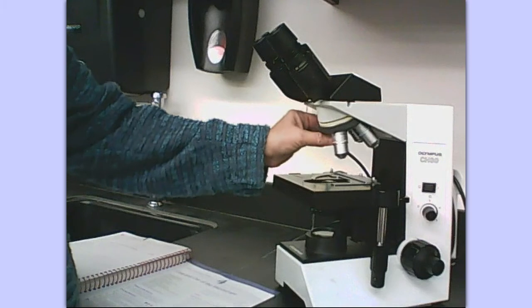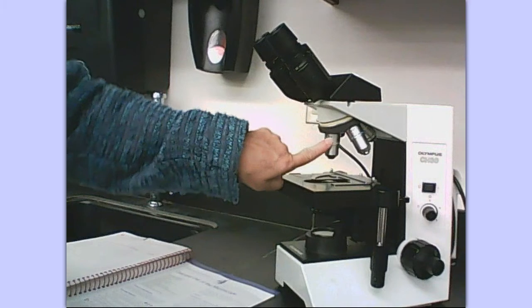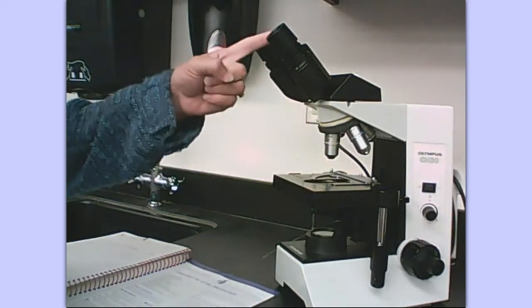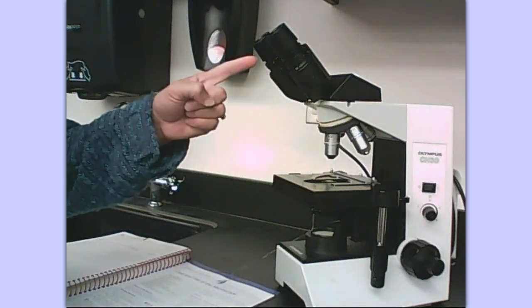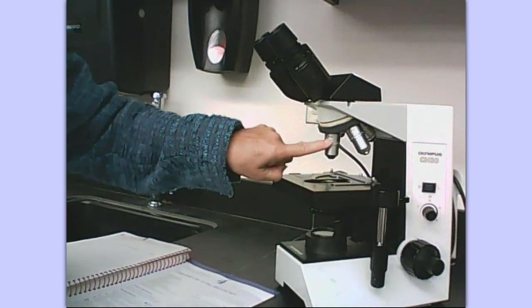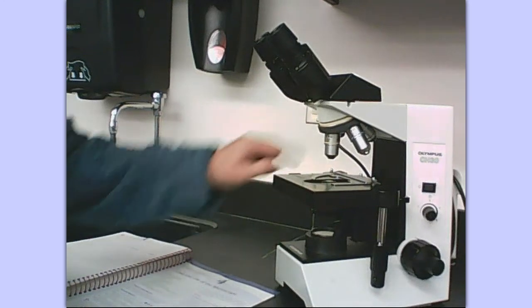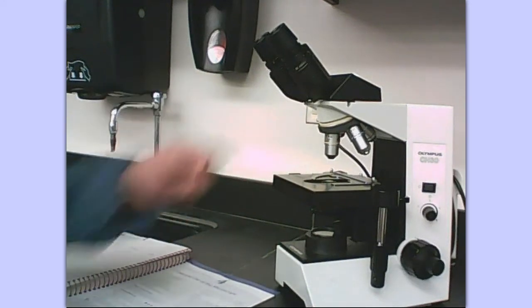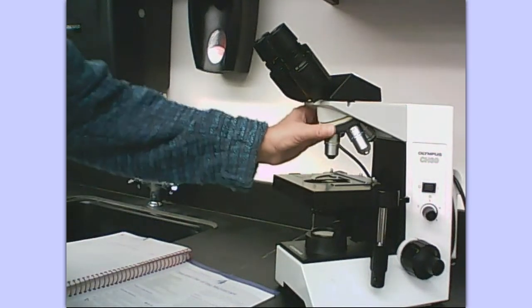The next objective is low power, and it has a magnification of ten. We're using two sets of lenses to magnify: the eyepiece is ten and the objective is ten, so the total magnification is ten times ten — one hundred times. So if we're using this objective to focus in on an object, we're seeing it at one hundred times its original size.